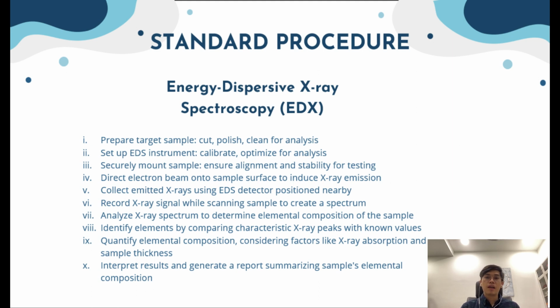Eighth, identify elements by comparing characteristic X-ray peaks with known values. Ninth, quantify elemental composition, considering factors like X-ray absorption and sample thickness. Tenth, interpret results and generate a report summarizing sample elemental composition.